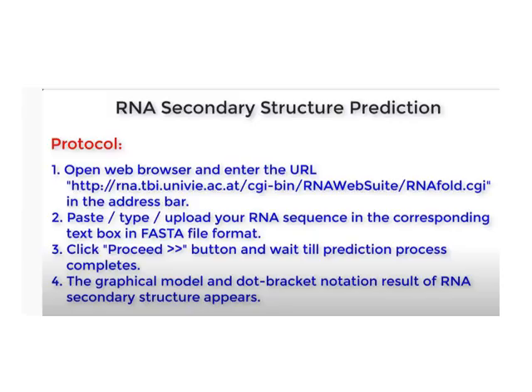So basically, we go through a protocol on the web server. We have a few notes before we go to the server. As we understand, we need first to generate our secondary structure based on the primary sequence of the long non-coding RNA.